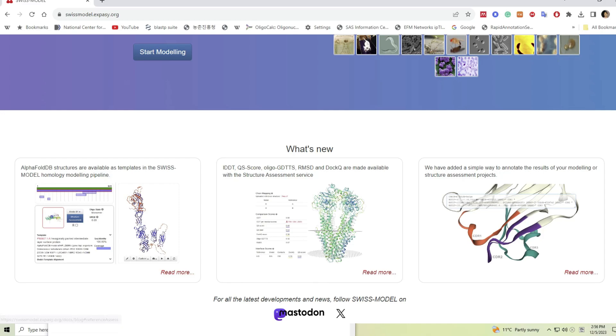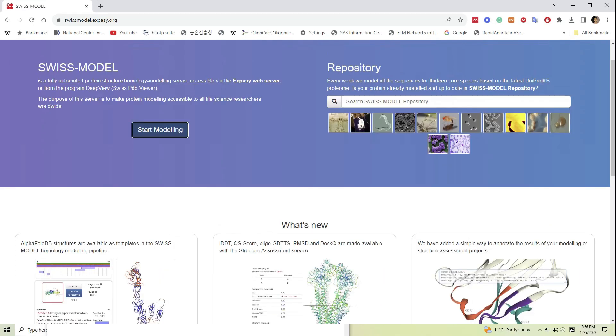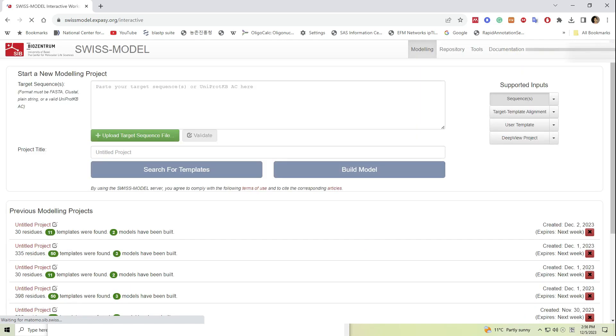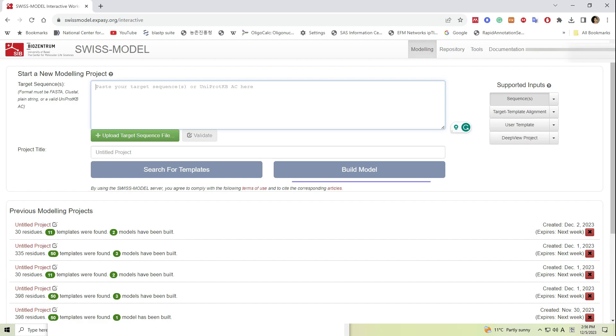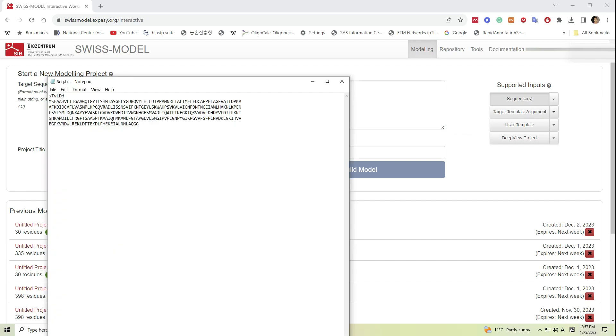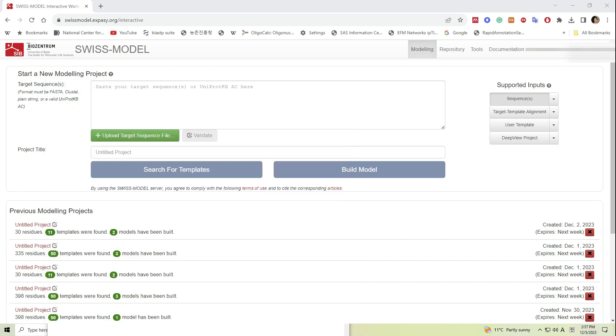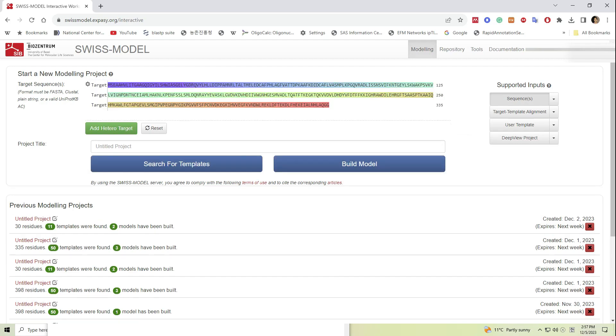Now we can click on the start modeling button and see what we are going to get. Here in this window we have two options: one is search for templates and the other one is build model. If you choose the second option, that is build model, the entire process is automated. What you have to do is submit the sequence and wait until SWISS-MODEL produces several models for your query protein. However, I personally prefer search for template option as it allows me to choose relevant templates proposed by SWISS-MODEL by accessing several structural databases.